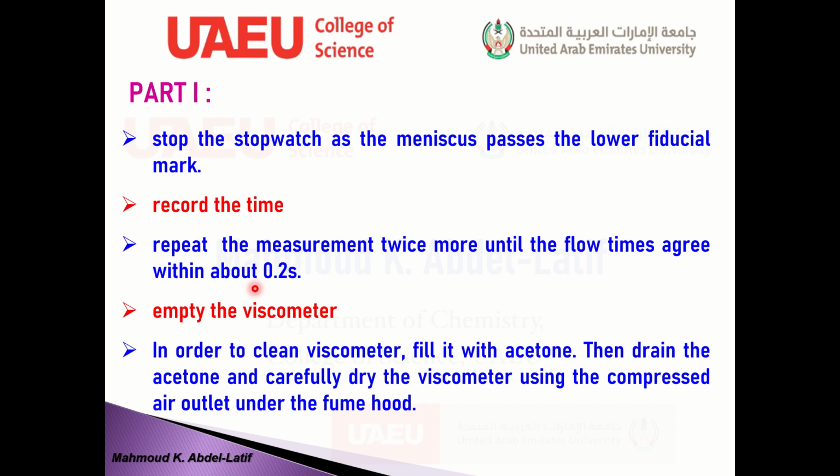Empty the viscometer into a designated waste bottle. In order to clean it, we are going to use acetone, which evaporates easily, and then dry it carefully using the compressed air outlet under the fume hood.